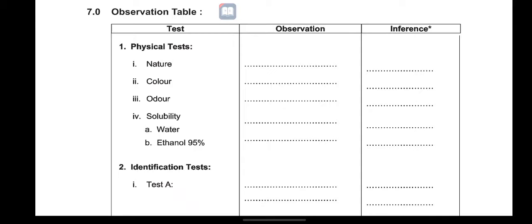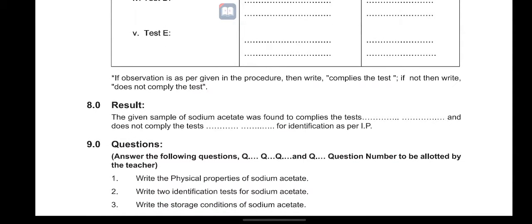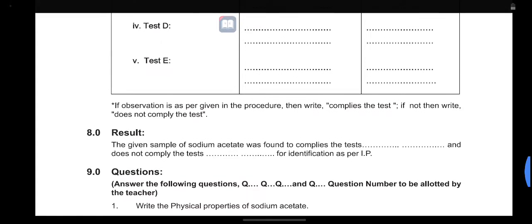This is the observation, inference and result for tests A, B and C. Okay, you can write here whether it complies or does not comply. Thank you.